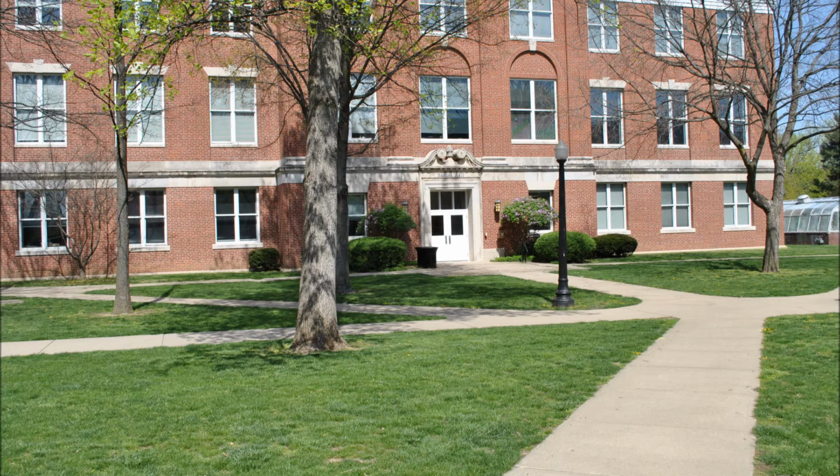I will try to have enough plates available for these media we're using in lab for you to use your unknown as well. And particularly if you have a gram-positive unknown, some of this media might be useful and helpful for you. And then the second part we're going to do is motility tests.